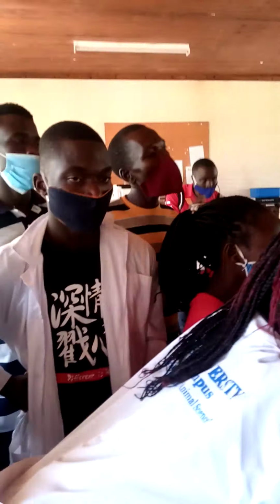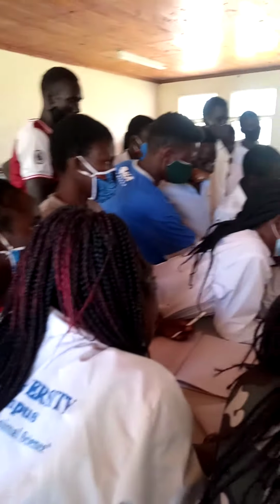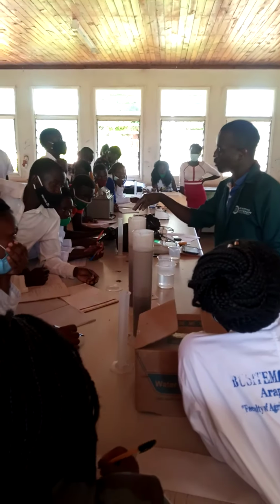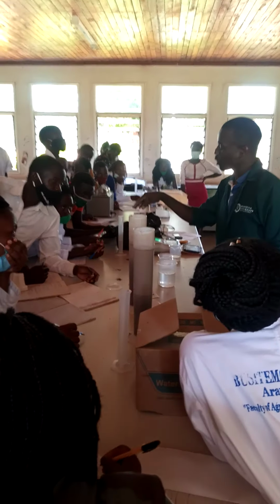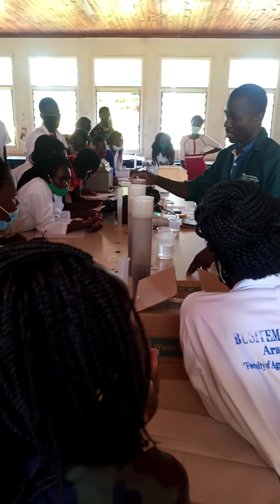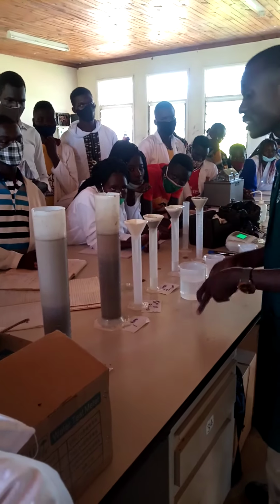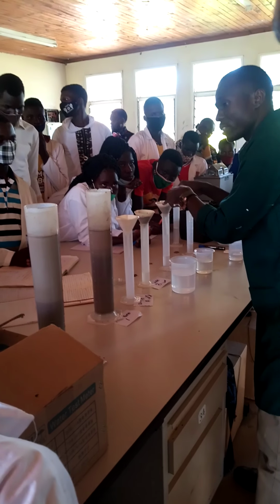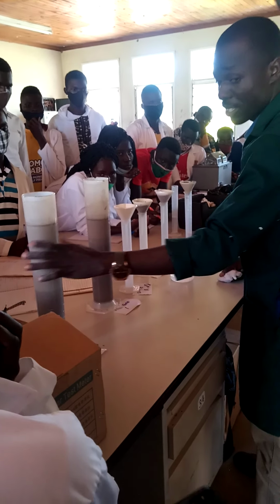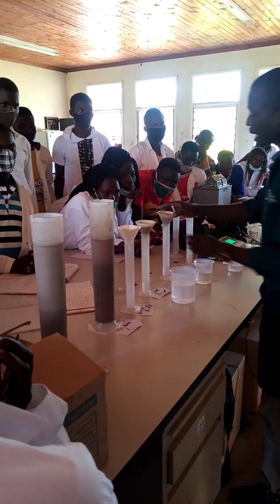Now, she was asking, why did this one here drop the water later than this one here? It means that it is because of the level of the concentration of clay. Perhaps this place here took a shorter time to release the water. We have not determined how much clay is incorporated here. Those are things that I wanted us to go through.